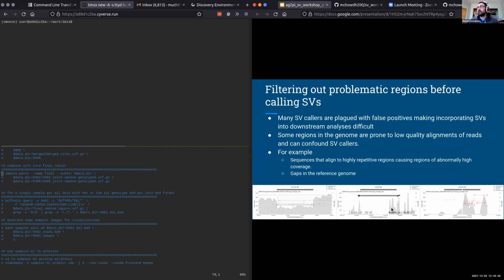The genome that this image was generated from was about a 60x coverage genome. So if you're seeing regions that are upwards of 200 or above, you're probably seeing abnormally high spikes in coverage in what's generally a poorly behaved region for SV calling. And regions like these are going to cause false positives at a higher than normal rate. So even though an SV caller may have called this region as a deletion, it's unlikely that this was actually a true positive deletion, and it's likely going to be a false positive. Whereas this region here is a nicely well-behaved region where coverage is as much as you would expect at its highest point, and then at this point you see what is essentially a one copy loss deletion.